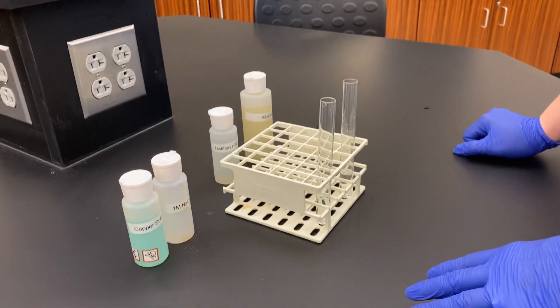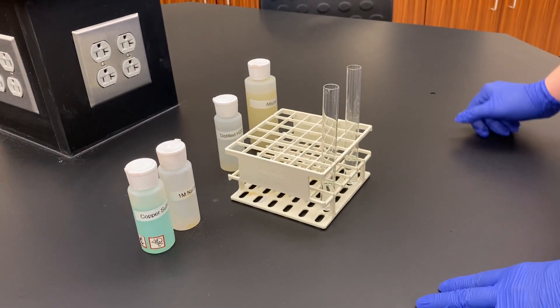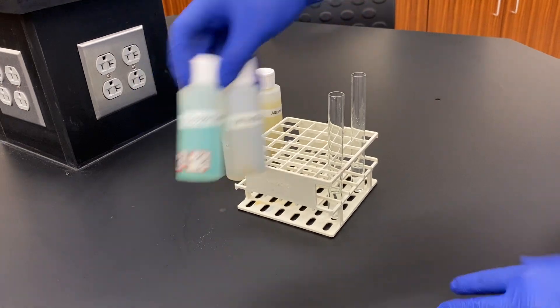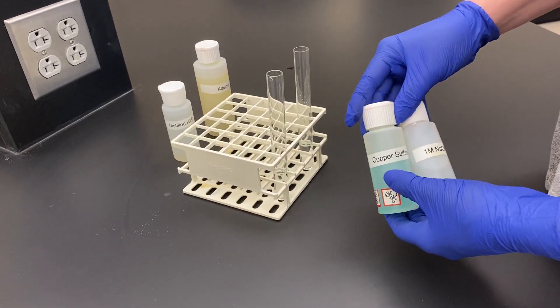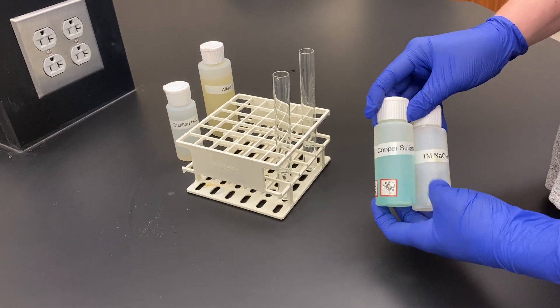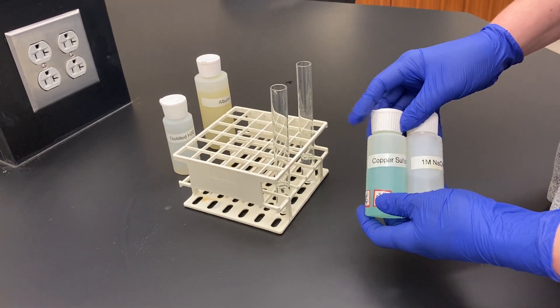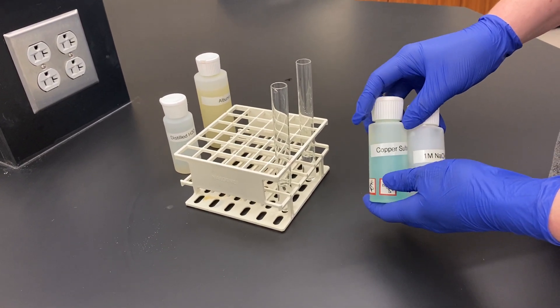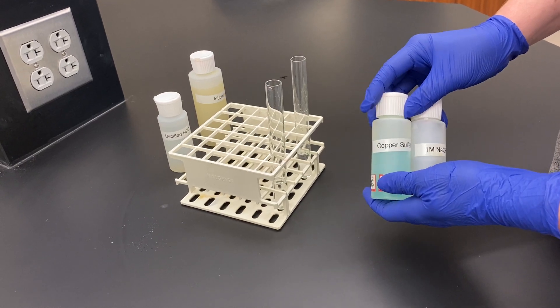In this test, we're going to examine for the presence of proteins. To do that, we're going to use two reagents: copper sulfate and sodium hydroxide. When these two are added together, they will react to form a blue precipitate if there's no proteins.